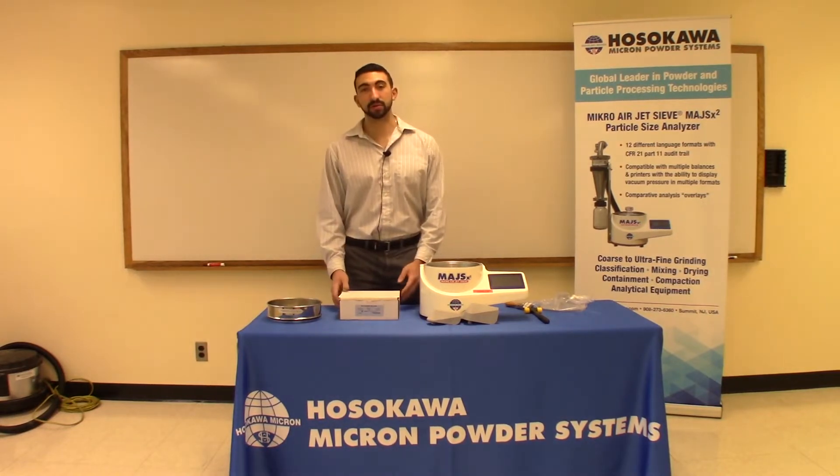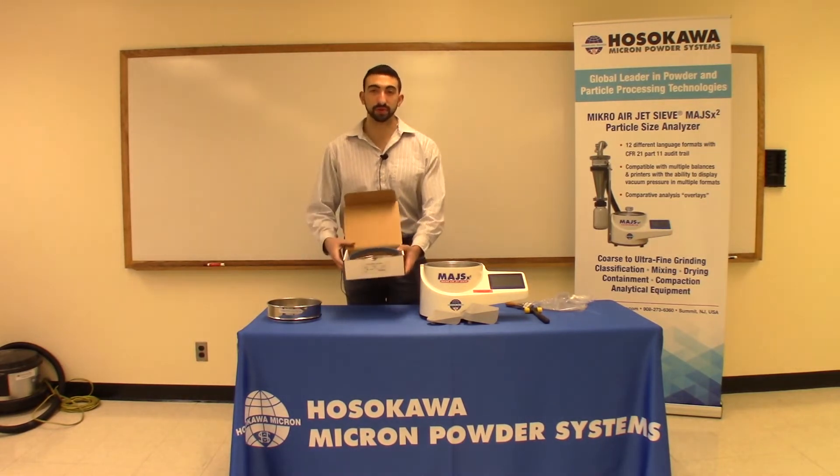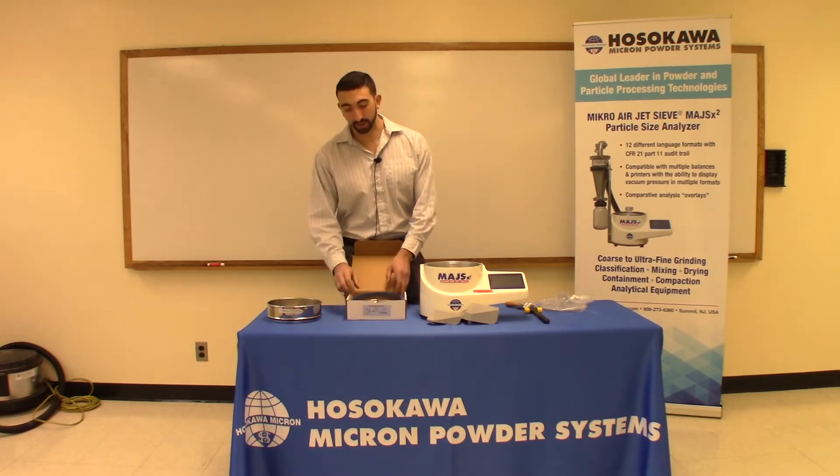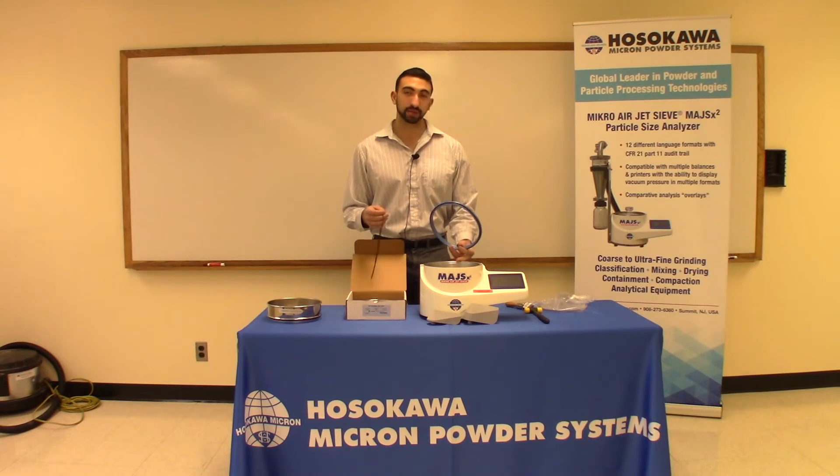When you purchase a Hosokawa sieve screen, what you're going to get is a box like this. Inside the box is going to be the sieve screen, blue gasket, and black o-ring. You can discard the blue gasket because it's not necessary for the casting on the MAJS-X2.